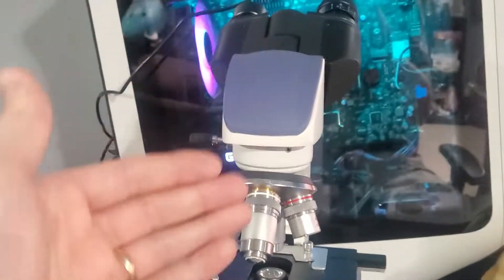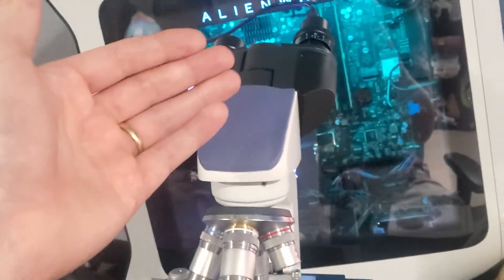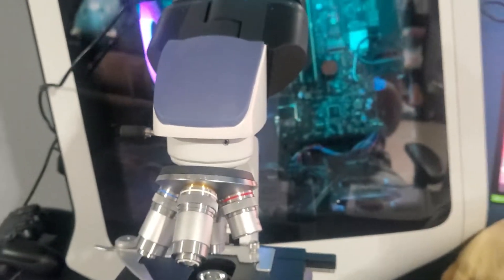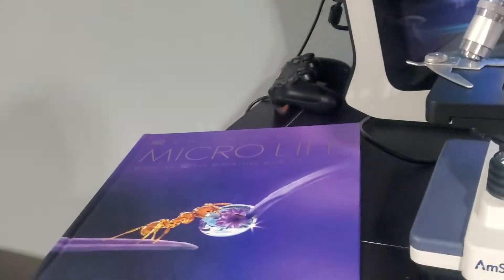You might be wondering why the microscope is set that way with the eye holes not facing you — that's because I'm going to be viewing the microscope through the software on my computer. Pretty exciting. You can see the light down below. I will see you guys another time, thanks for checking these products out with me, have a great day!